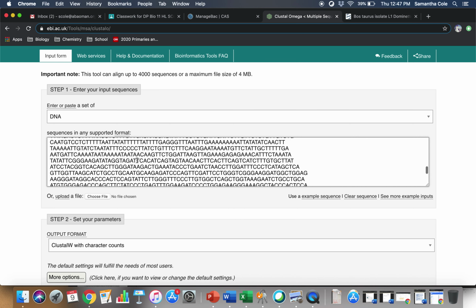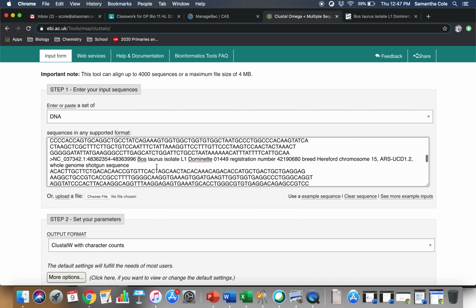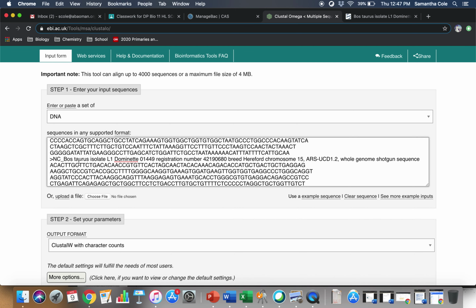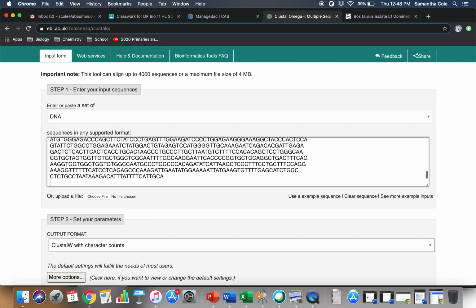Okay, come back up again to where it said the Bos Taurus for the cattle and back out those numbers just so you can know later what you're talking about. And back out that extra space there. Come down here, hit enter. I am ready for my next sequence.